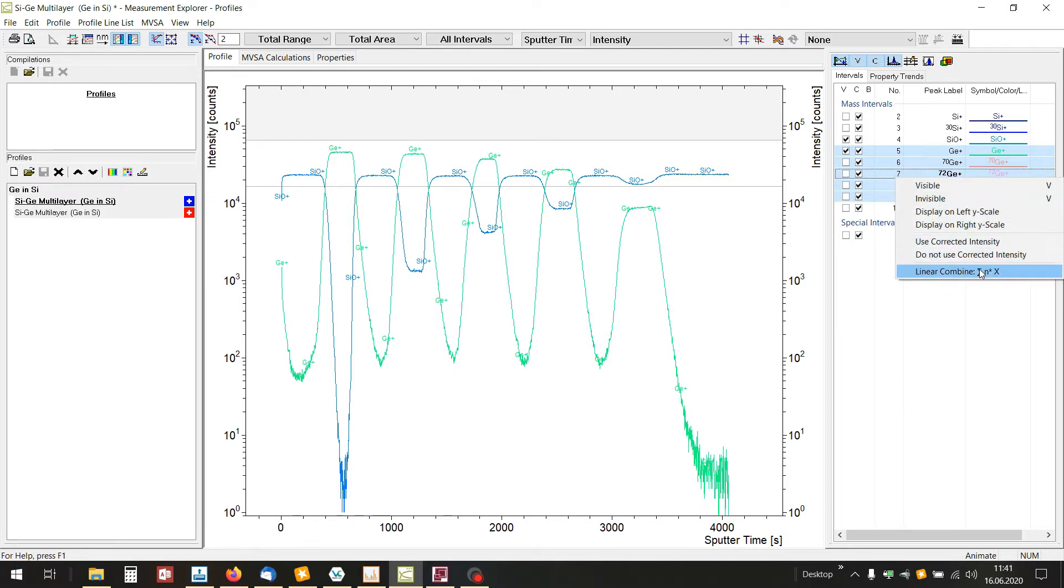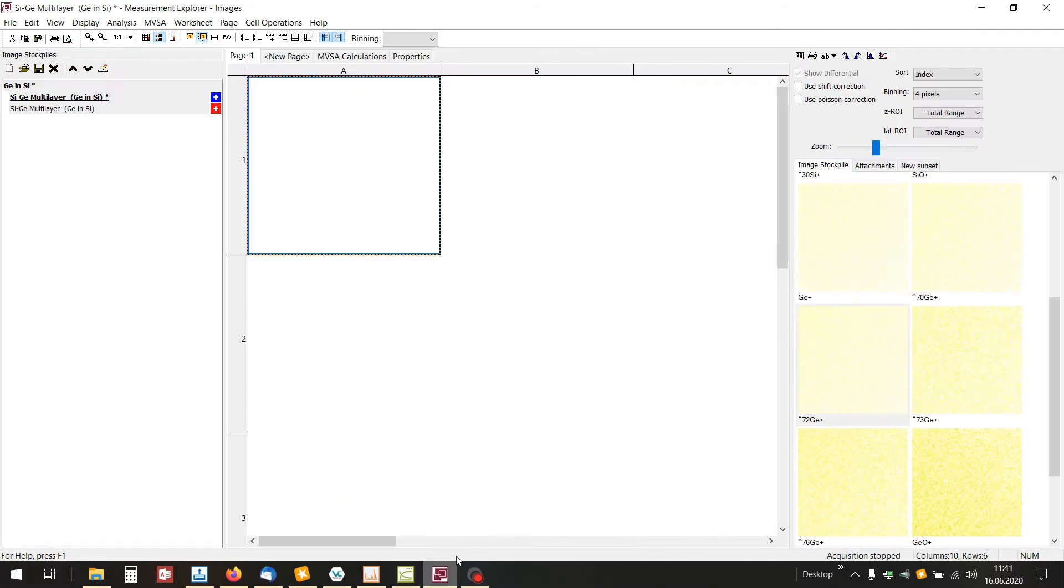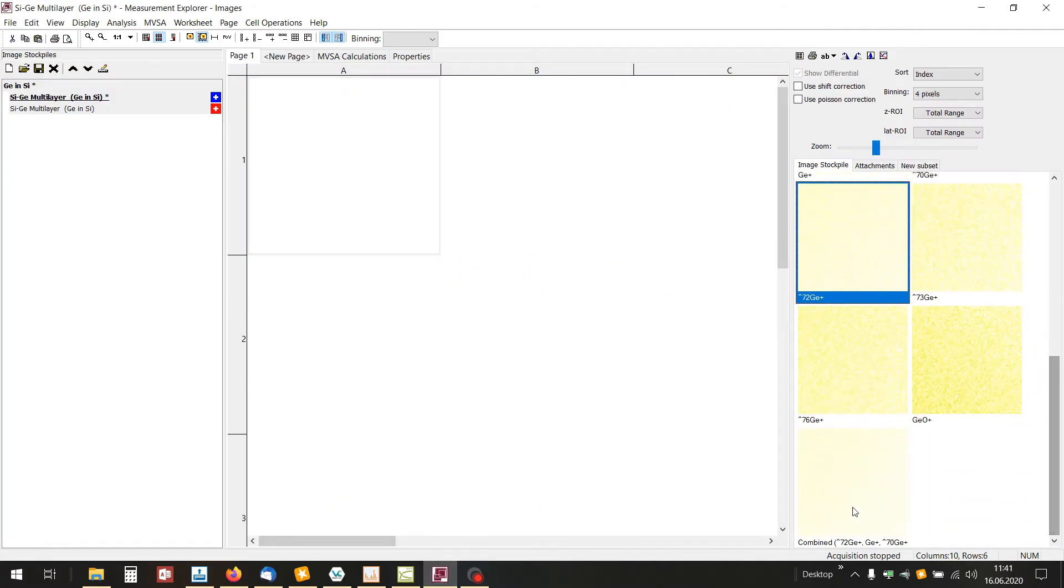The linear combined intervals are directly transferred to the images program for fast and direct access for 3D rendering for example.